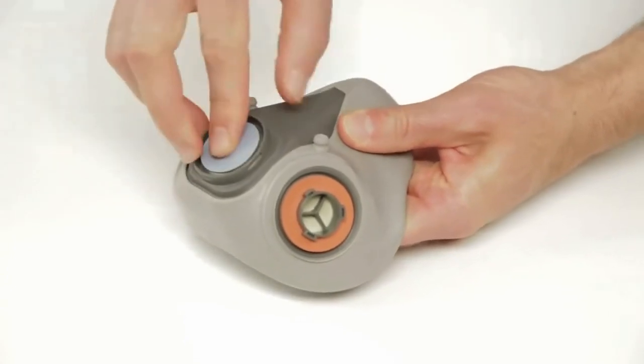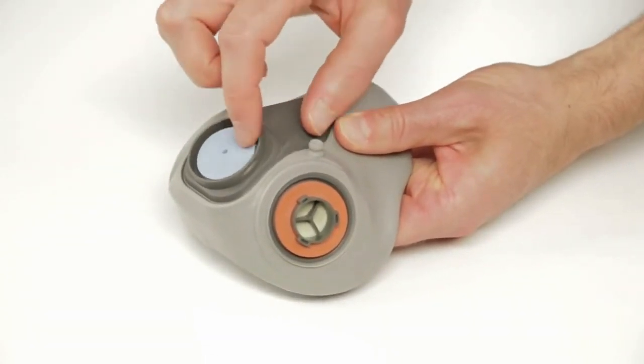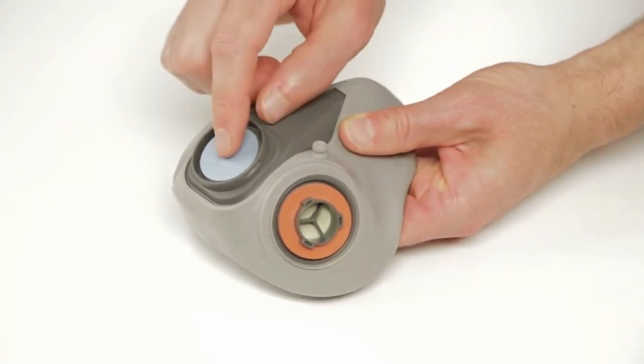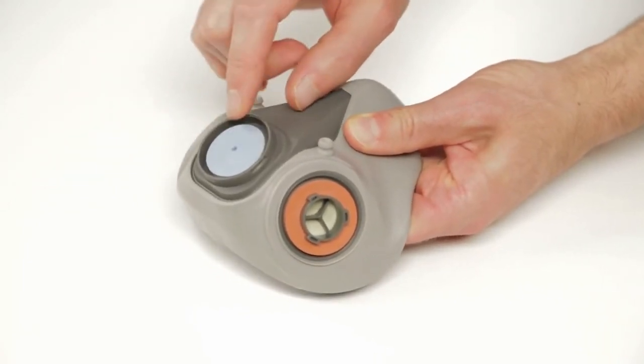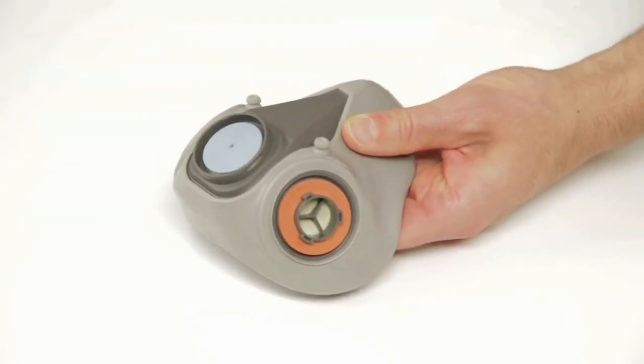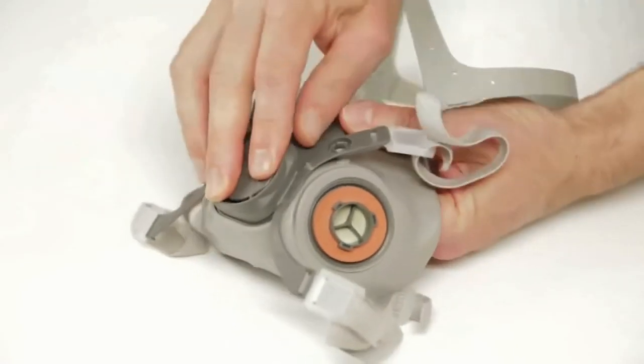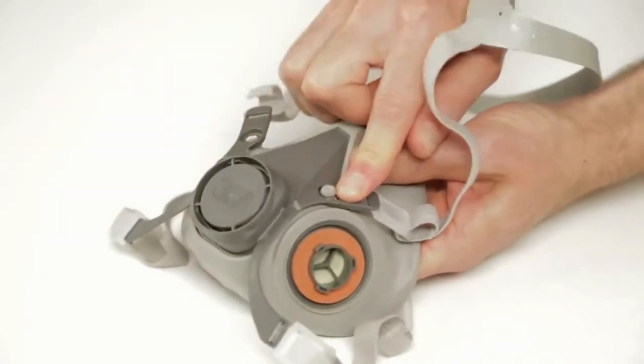Insert the stem into the center hole and press firmly on the valve. Make certain the valve is fully seated and spins freely. If the valve does not spin freely, push on the valve again until the stem is fully seated in the center hole. Replace the respirator strap assembly as you did before.